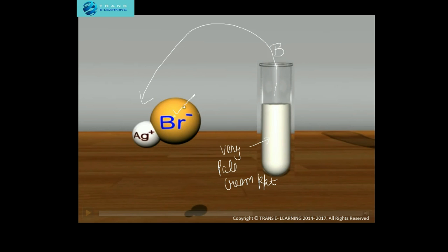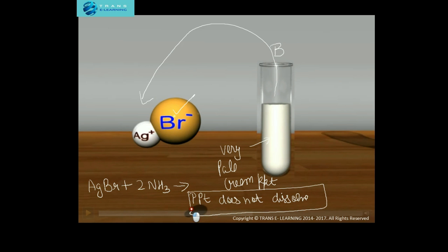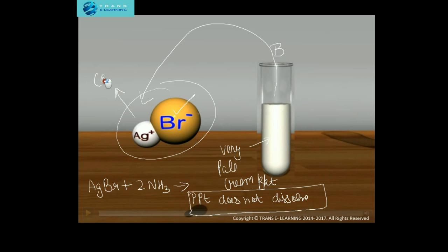Now for the confirmation test: if we add a few drops of dilute ammonia to the precipitate of silver bromide, the precipitate does not dissolve. This forms the basis to distinguish silver chloride from silver bromide — silver chloride dissolves with dilute ammonia, but silver bromide does not. So we need to use concentrated ammonia solution.